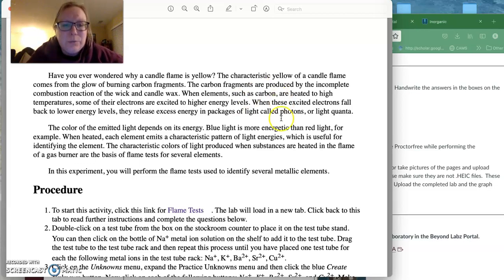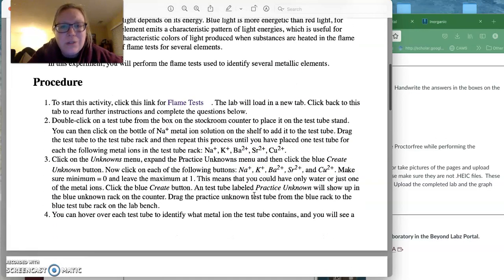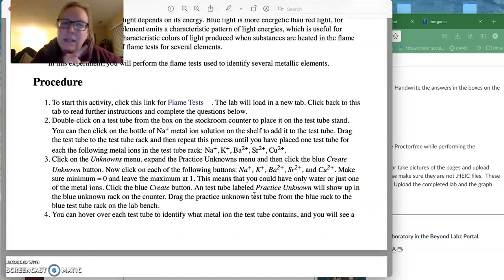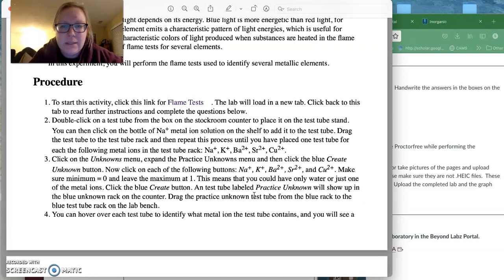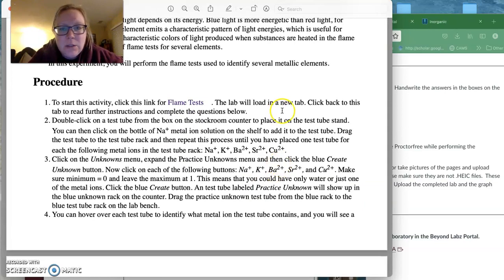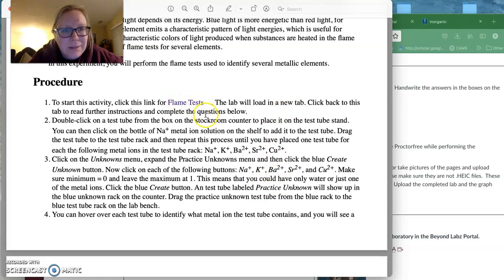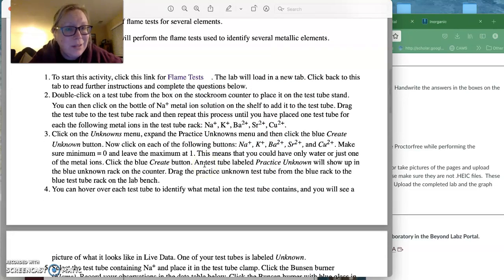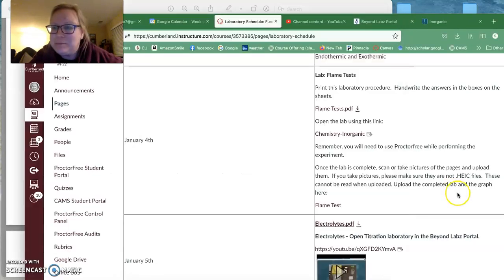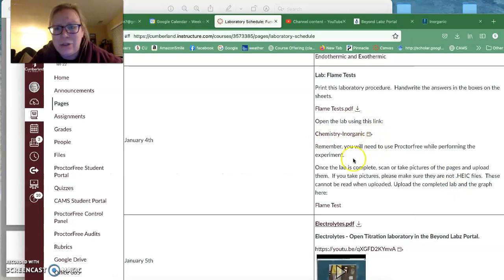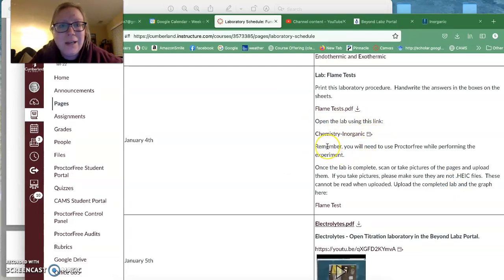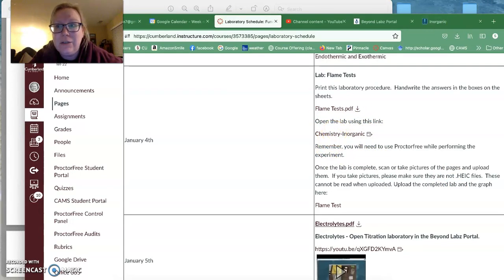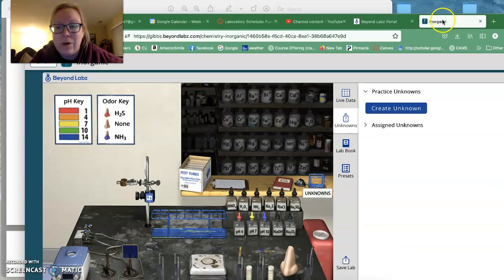So what we're going to do is we are going to do some flame tests. Now we're going to deviate a little bit from what they say here and I'll show you that in a second. Of course it's going to say click this link for a flame test, but this is a PDF so the link isn't going to work. So instead you need to start that chemistry inorganic lab again. And so you'll just click here to start that. I've already pulled it up.